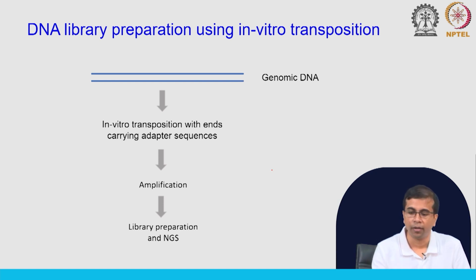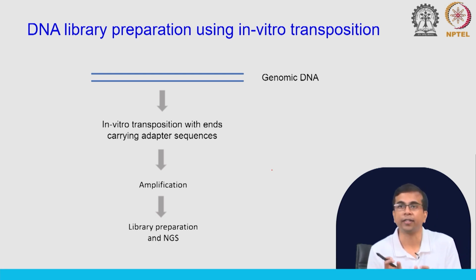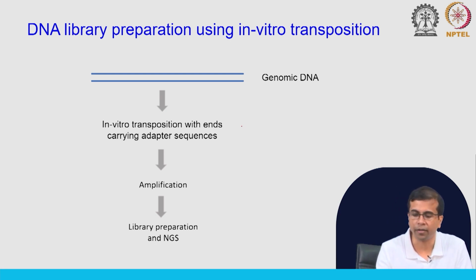Once you have isolated genomic DNA, you do transposition in vitro, in the test tube, and these sequences that are inserted contain adapter sequences. So, imagine you have this transposase enzyme, like this.